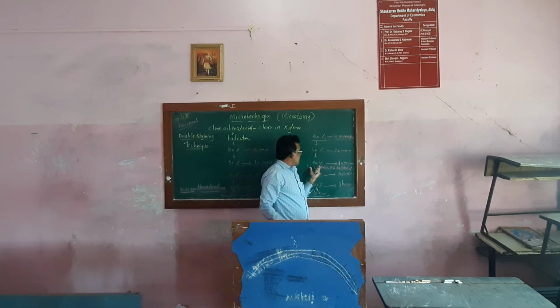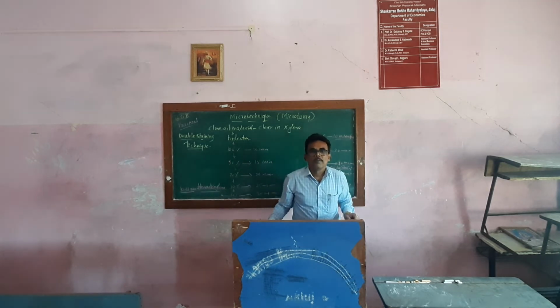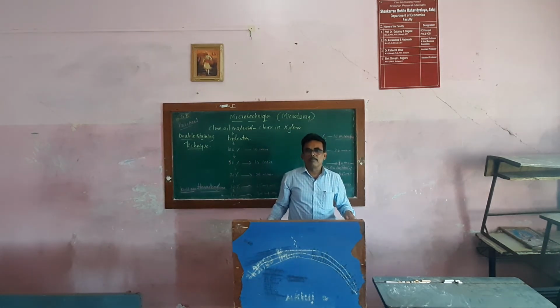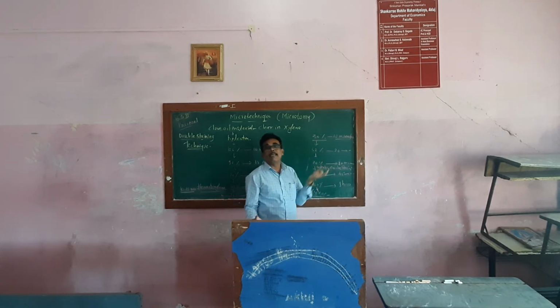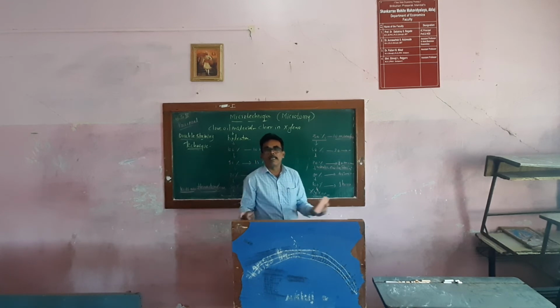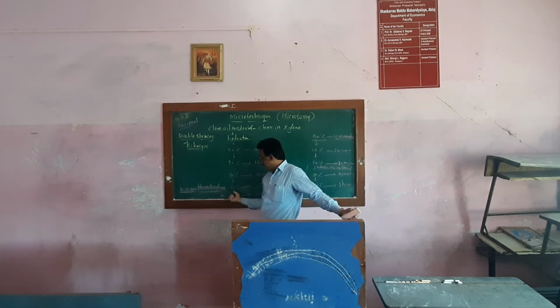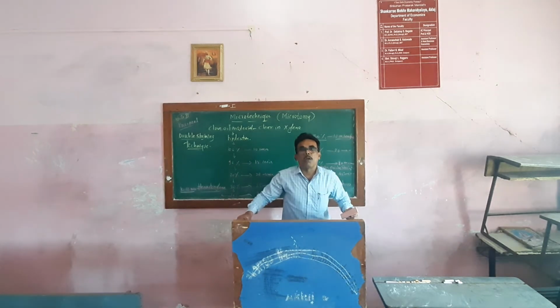And afterwards you have to pass that material to the 90%, and here you have to observe the slide. While observing the slide, you check whether the material has been stained, whether double staining has happened, whether hematoxylin is there or not, and whether cytoplasm is there or not.